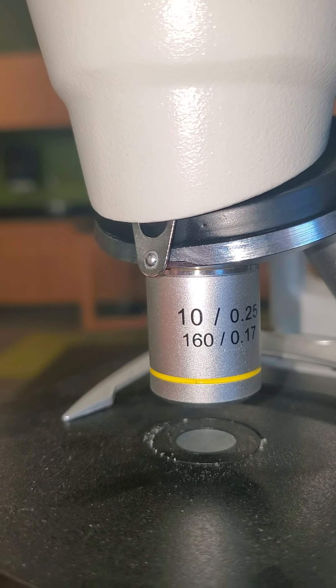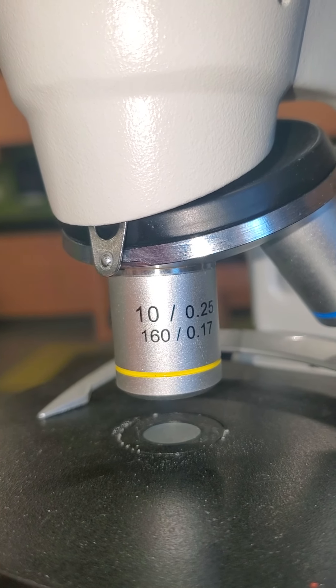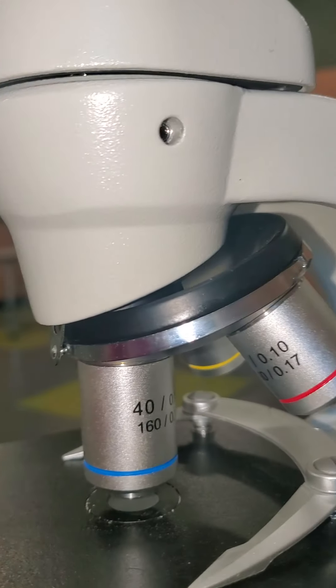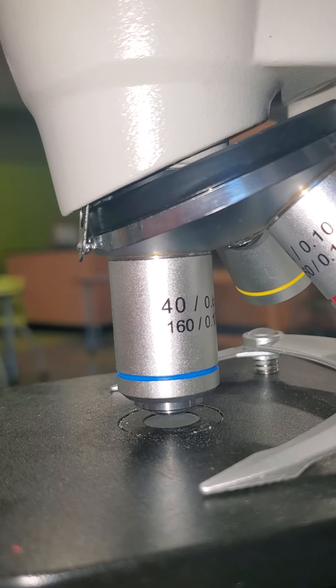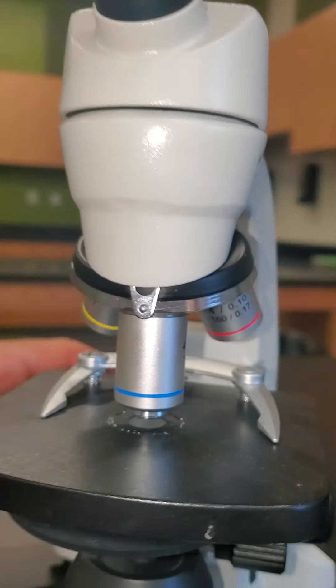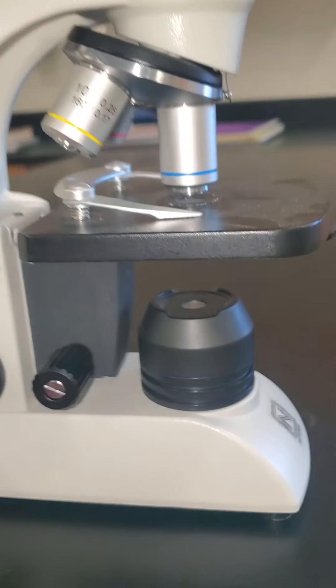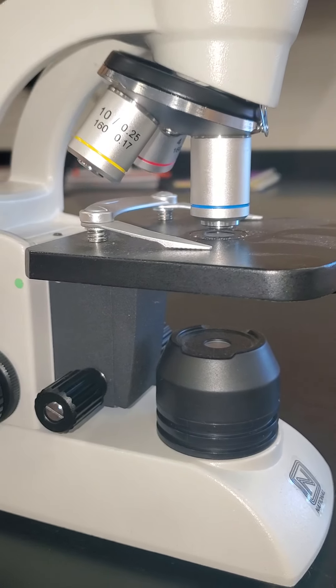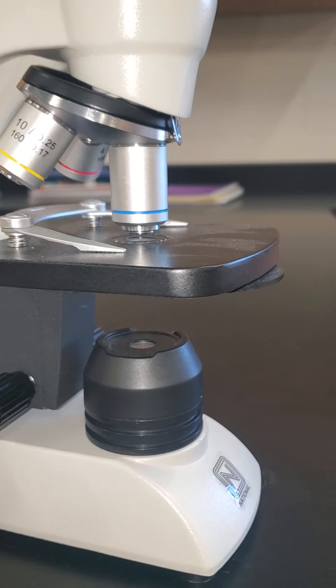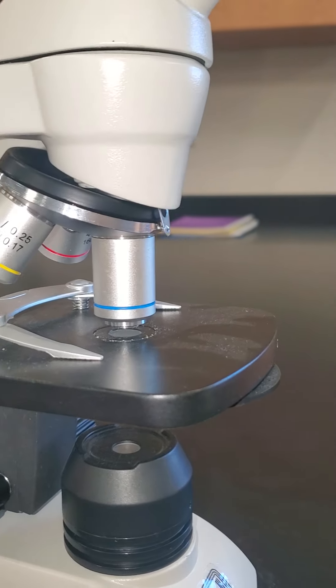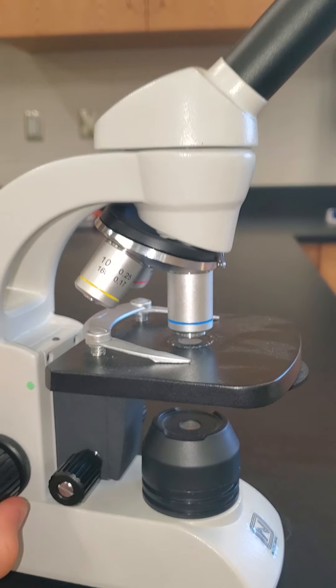The yellow being medium at ten times magnification and the blue most powerful at 40 times magnification. So the bigger you want to make your image, the higher power lens you would use. Depending on the scenario we would have purposes of using a less magnified lens and in some cases we would want to use a more magnified lens.